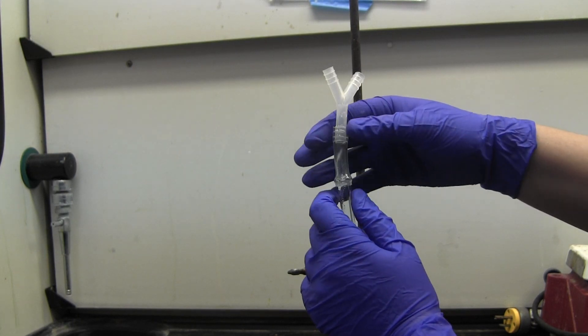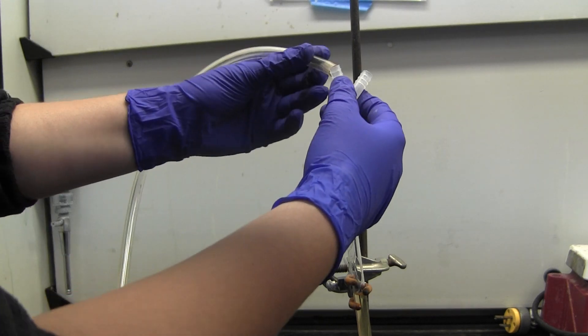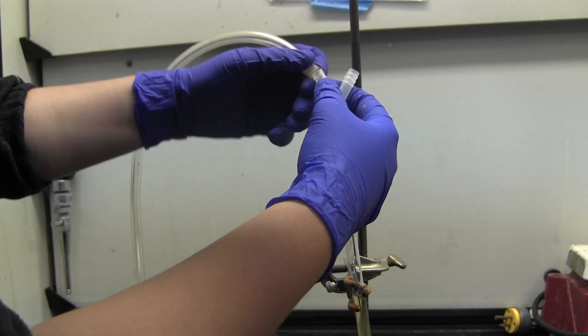To speed up the water, connect the plastic Y-joint to the top of the column. Then connect it with a tube to the nitrogen outlet. Make sure the stopcock is open.